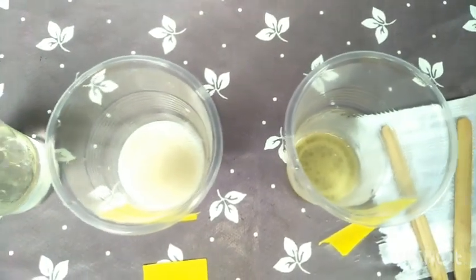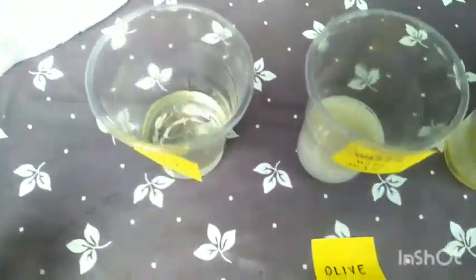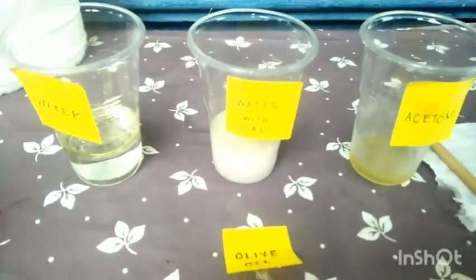Olive oil is also insoluble in water and water with soap, and it is soluble in acetone.